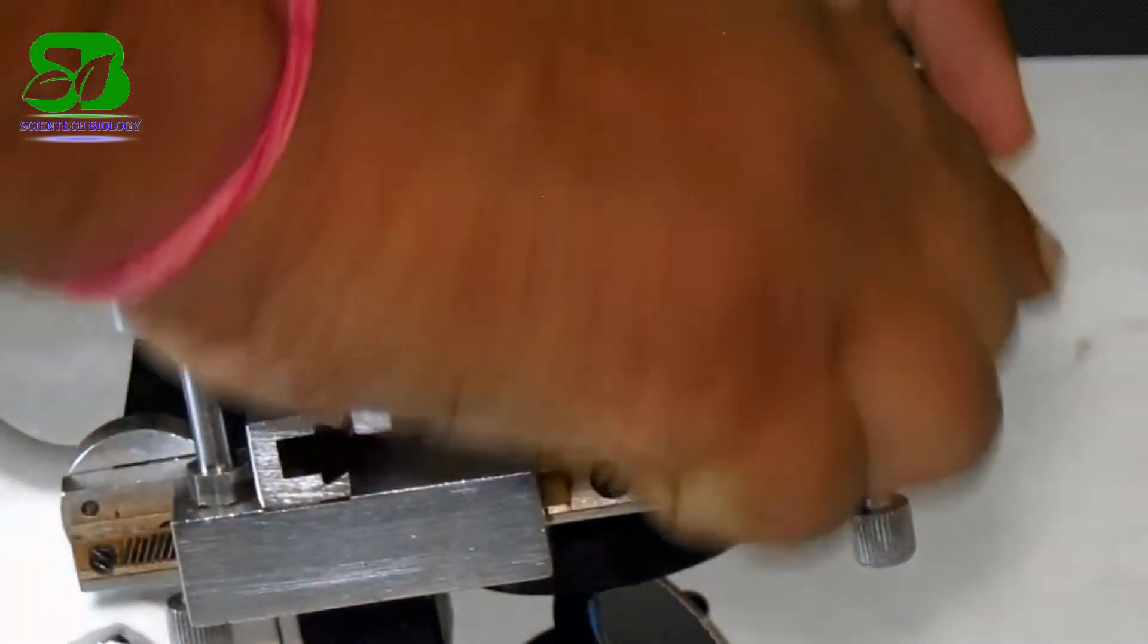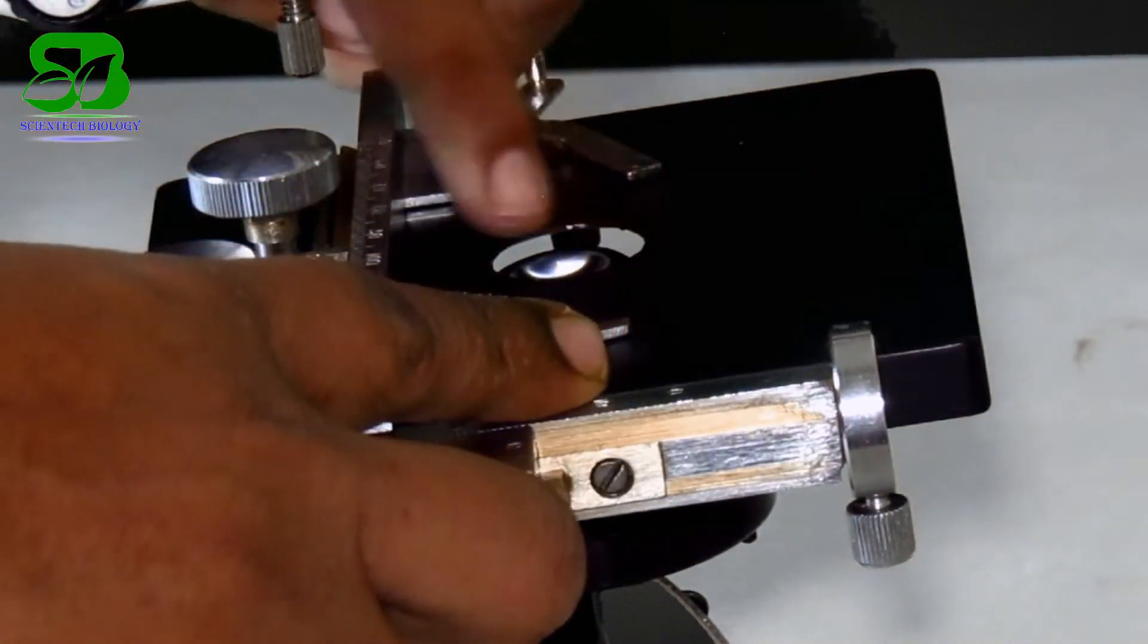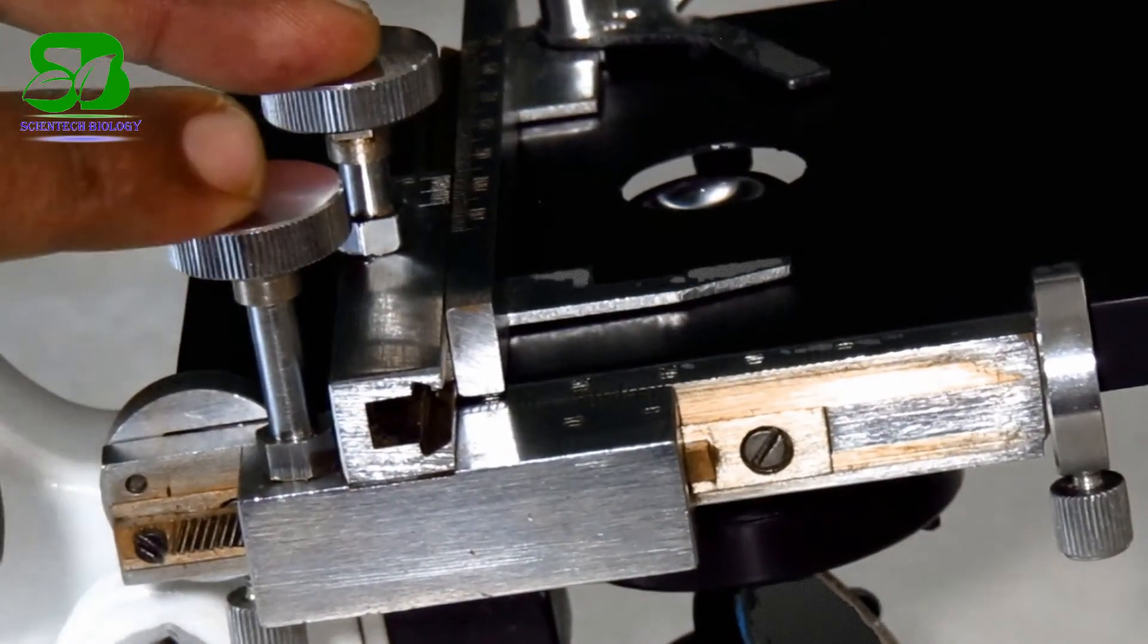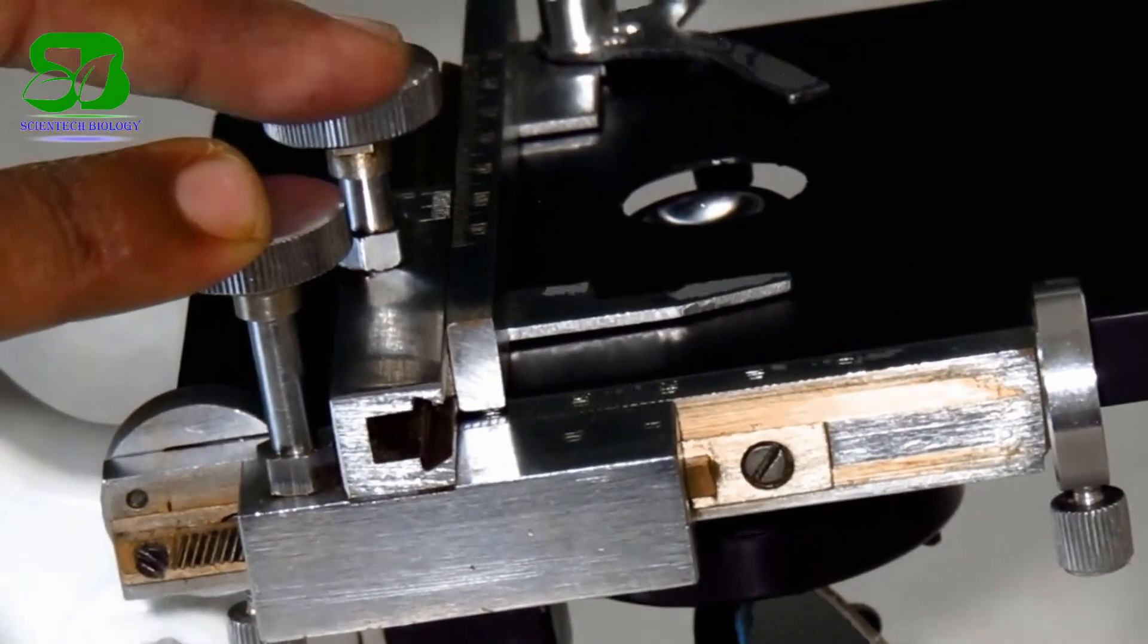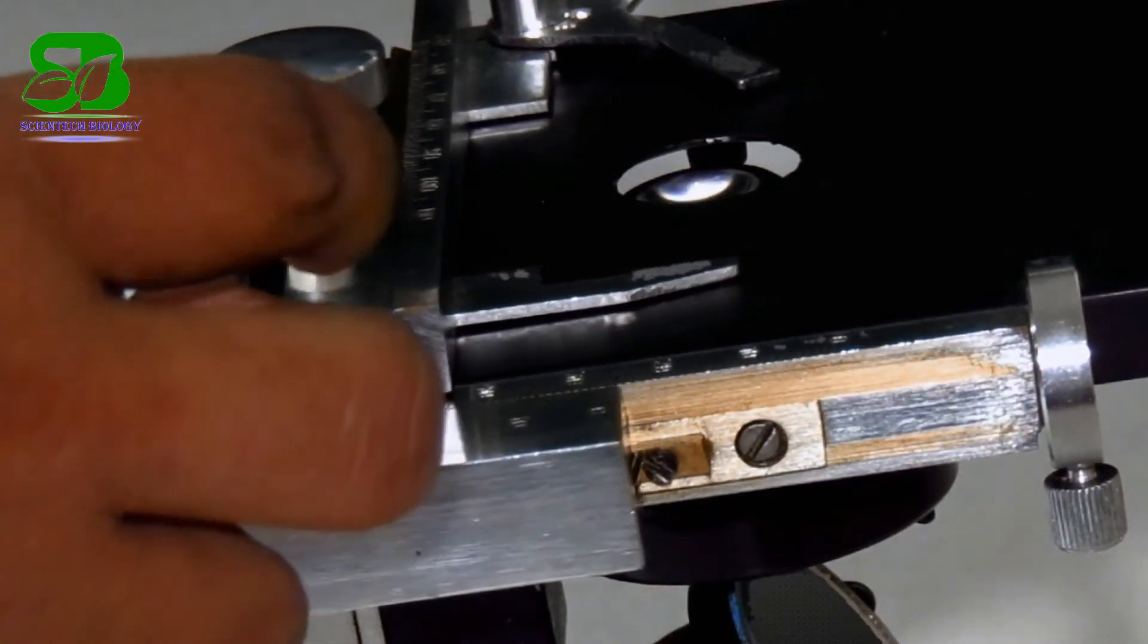This flat square platform having a circular hole at the center is the stage. Here the two mechanical clips hold the slides. You can adjust the clips by rotating them clockwise or anti-clockwise.